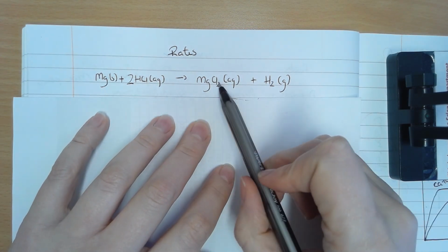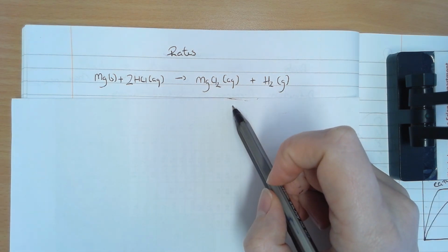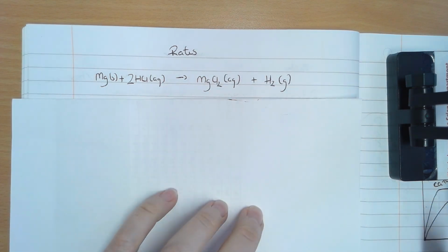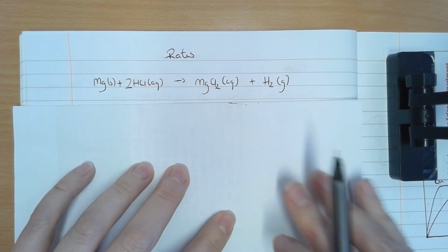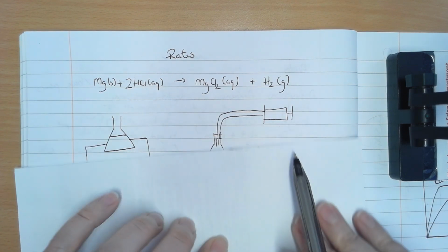So I've got an equation here, and you could get asked to design an investigation to show how you would measure changes in temperature on rate. So if you want to investigate how temperature affects rate, you need to be able to measure the rate of a reaction. Because this particular reaction is producing a gas, you've got two choices.